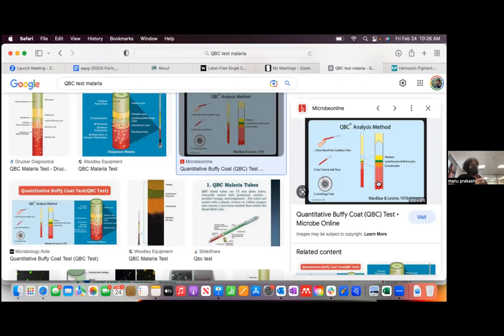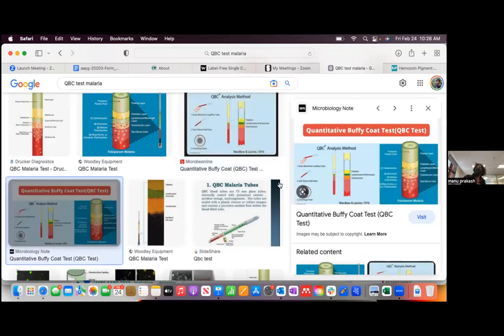And how does that help in doing it? What that helps is that all of these layers that you can see, platelets, lymphocytes, granulocytes, trophozoites, all of these little layers of malaria parasite, it's very subtle in this. It's actually, there is that little triangle.